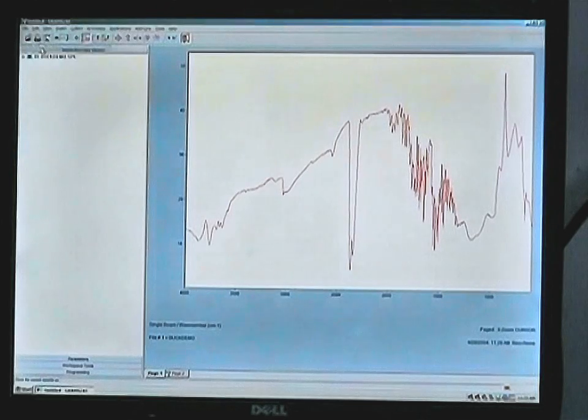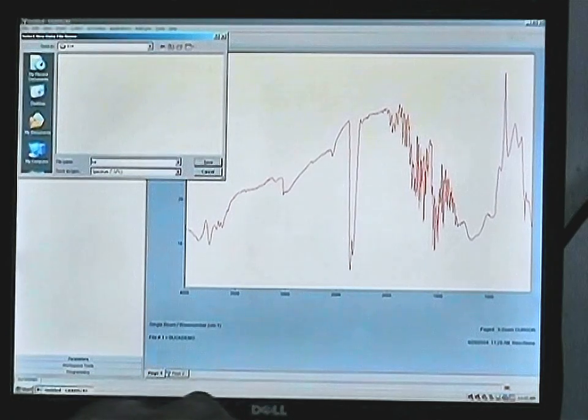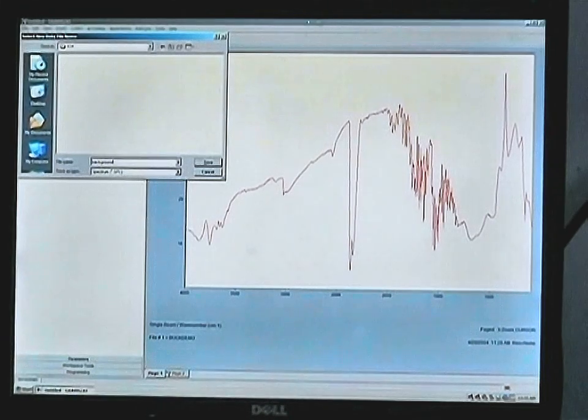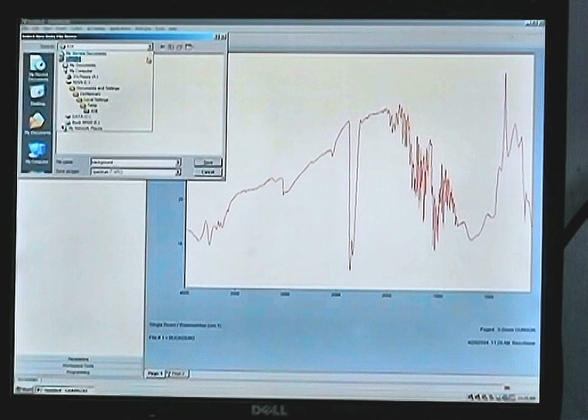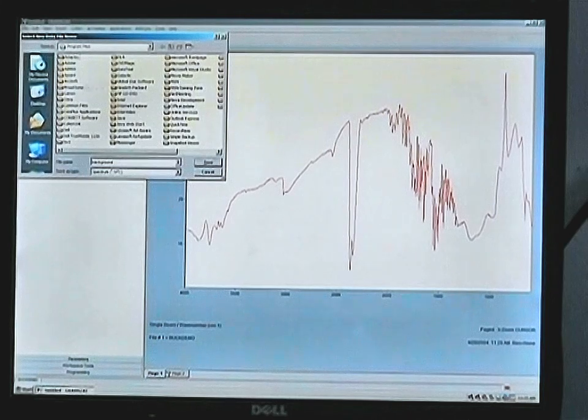Save trace as, and usually you give it a default name such as background. Remember where you put the file, as you will need to recall it later when doing your transmission scan. Save this in the appropriate data directory or wherever you want to keep your final spectrum.